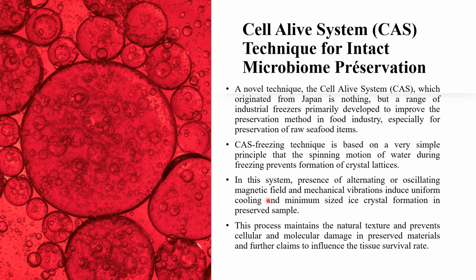In this system, the presence of an alternating or oscillating magnetic field and mechanical vibration induce uniform cooling and minimize the size of crystal formation in the preserved sample. This process maintains the natural texture and prevents cellular and molecular damage in preserved samples, and is further claimed to influence the tissue survival rate. So it enhances the survival rate of the microbiome as well as the tissue.